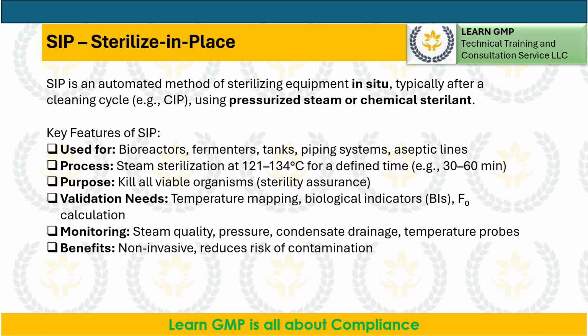Purpose. Kill all viable organisms for sterility assurance. Validation needs. Temperature mapping, biological indicators, and F0 calculation. Monitoring. Steam quality, pressure, condensate drainage, and temperature probes. Benefits. Non-invasive and reduces risk of contamination.